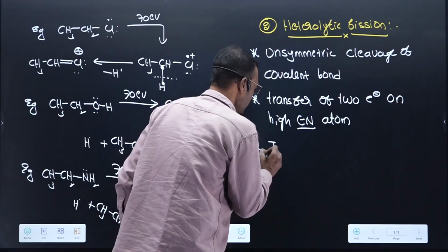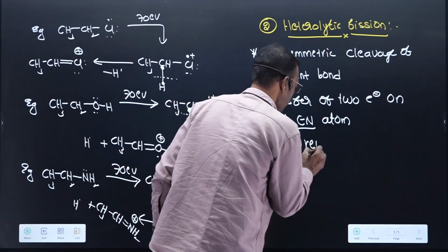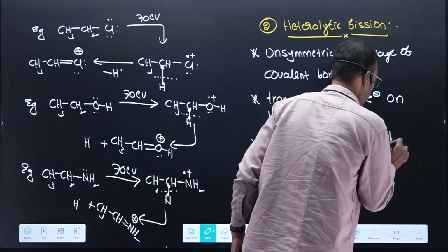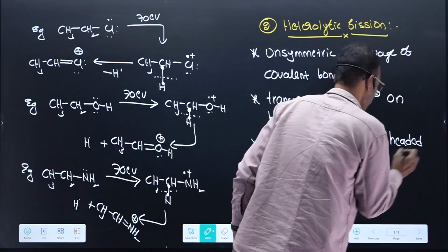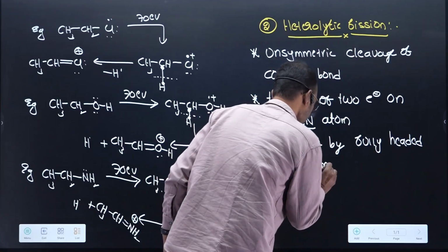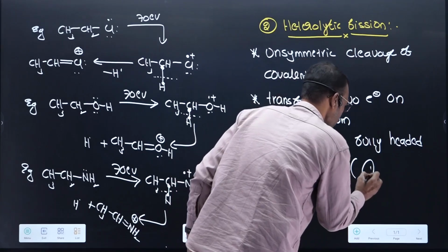It is represented by a full-headed arrow symbol.